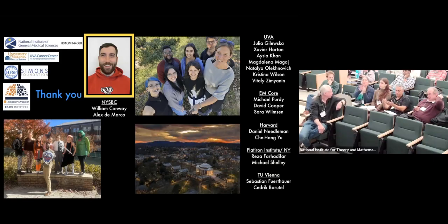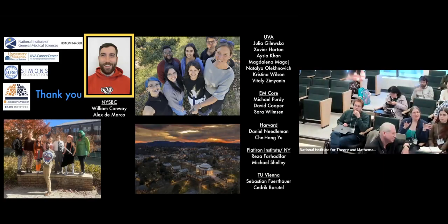They're just technical. This was really lovely, Stefanie. It totally made me think about a lot of things. But you said you saw no motors in that EM, so I was curious about that. Also, the spindle field, I assume, has done these sorts of high resolution EMs before, collected this sort of data in spindles or not. So I was curious whether there's other data out there that was already revealing some of the packing and alignment, and that could have been done, or whether it's really that we have to create these data sets each time.